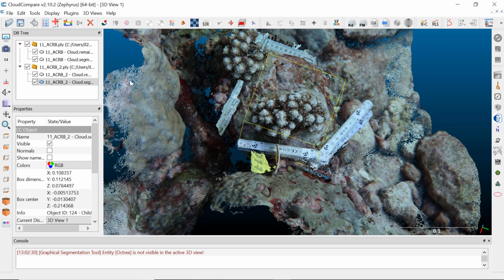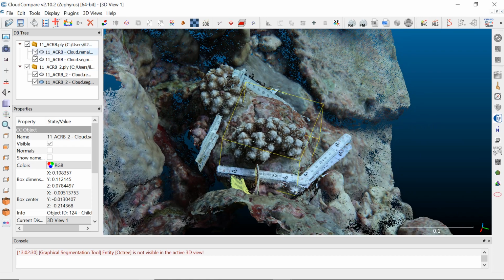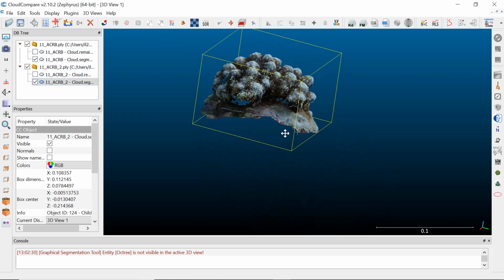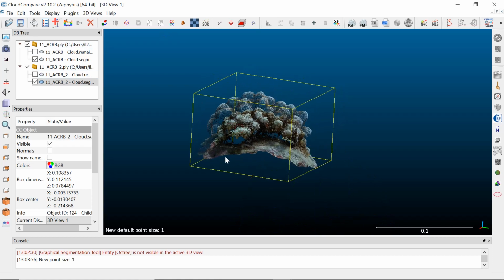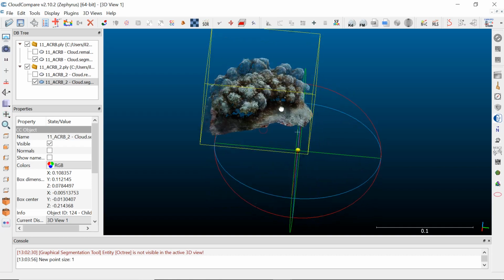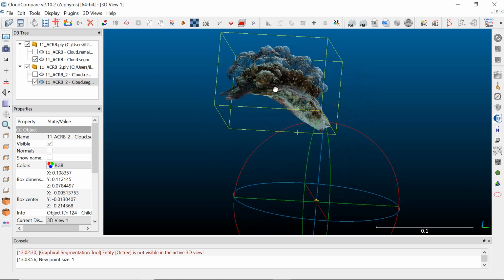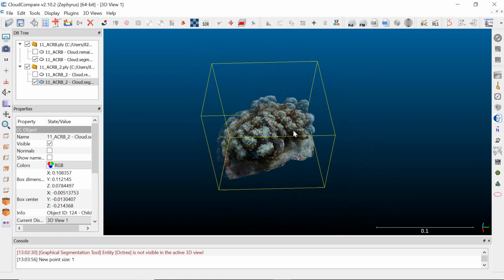The program keeps both the segmented in and segmented out area, but you can switch off the surrounding from these clouds. So you only keep the cloud segmented. We'll decrease the point size of the newer one so you can see the old one shining through. That looks good.